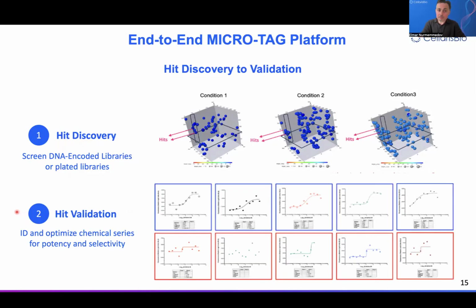After the fact of discovery, we can do hit validation. We can bring panels of compounds to the lab and we can screen them one-on-one against the target in whatever dose-dependent format to detect for potency and selectivity. You can identify your promising drug candidates, the blue boxes. You can also identify the non-promising or low potency chemotypes, and this information will guide and inform your SAR efforts.